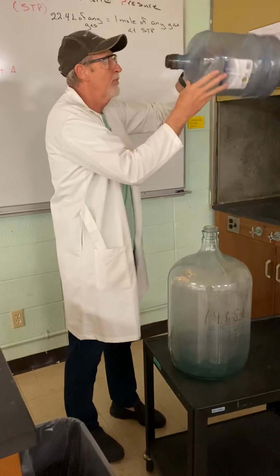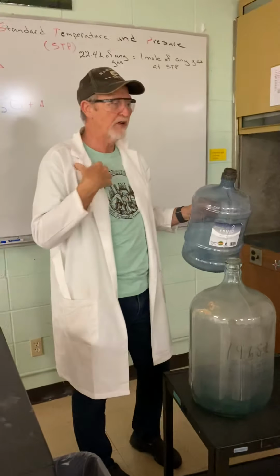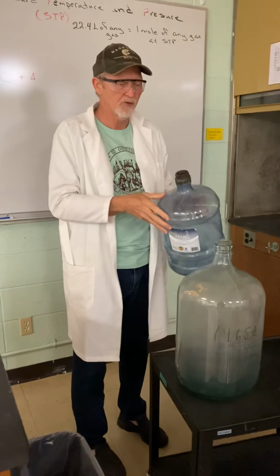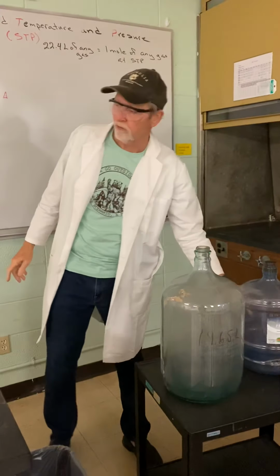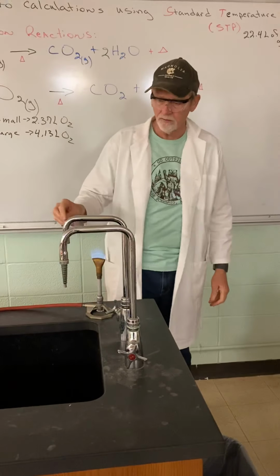Now, even blowing some carbon dioxide from my lungs in there, it's going to have some oxygen in it. So what we're trying to do is purge out some of the residual carbon dioxide. All right, so let's try that again and see if we get any flame at all.